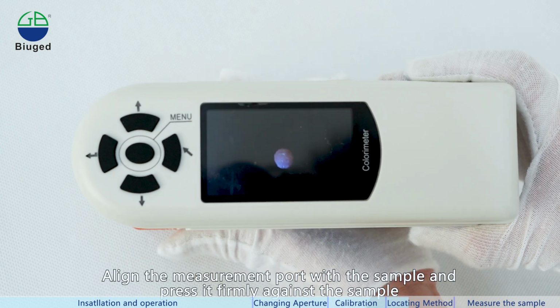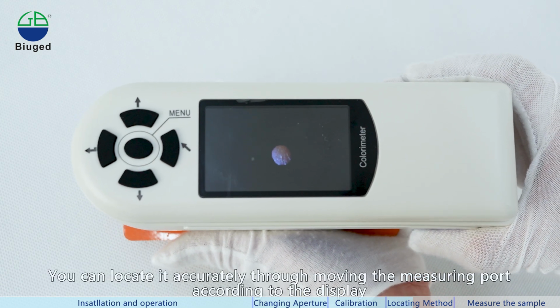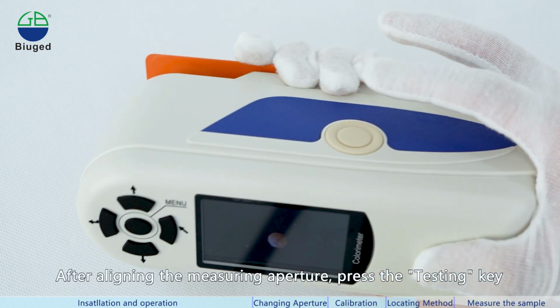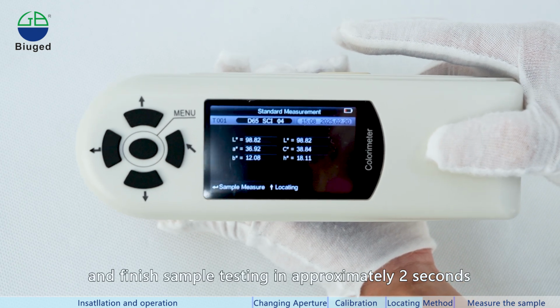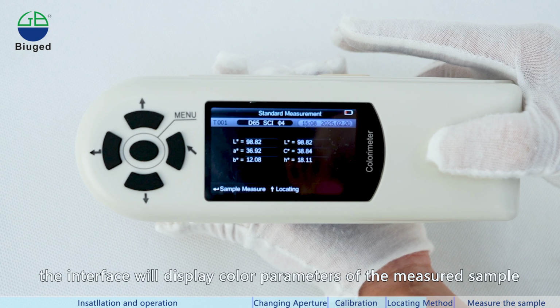Align the measurement port with the sample and press it firmly against the sample. You can locate it accurately by moving the measuring port according to the display. After aligning the measuring aperture, press the testing key. The instrument will exit the camera interface and finish sample testing in approximately 2 seconds. The interface will display color parameters of the measured sample.